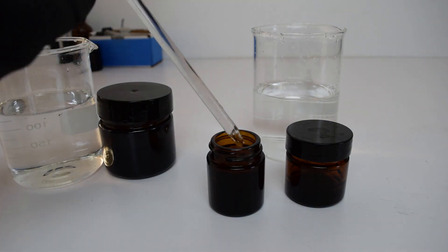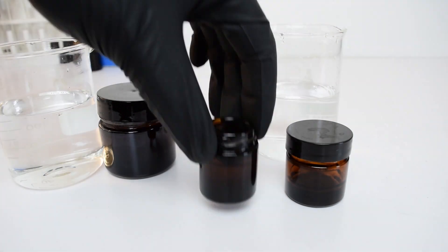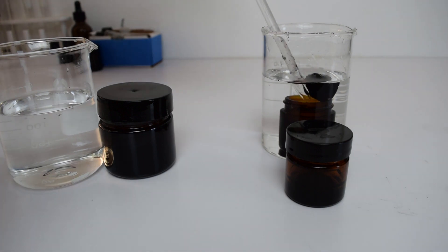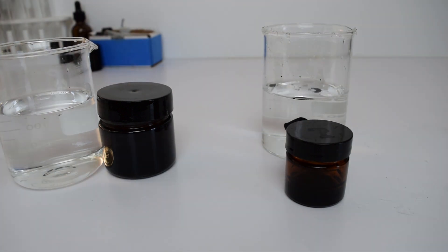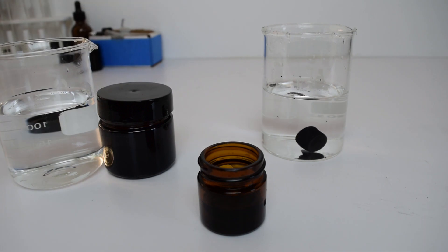Once cooled, you can remove the reduced graphene hydrogel into a glass of deionized water. I am being extra careful here, but the hydrogel has a consistency of jello, so I could simply duck the containers into the glass and the hydrogel will lift out.